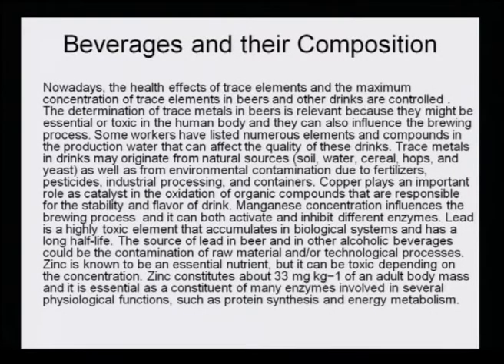So, sometimes these metals can have a very complicated health effect, and the health effects of trace elements and their maximum concentration in beer and other drinks are controlled, because brewery is a very important industry all over the world. Therefore, the determination of trace metals in beers is relevant, because they might be essential or toxic in the human body, and they can also influence the brewing process.